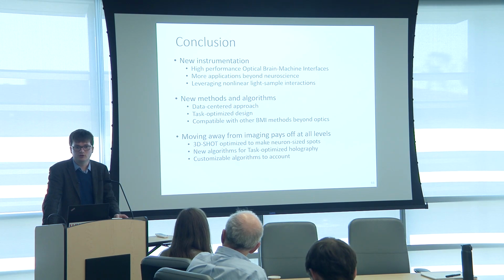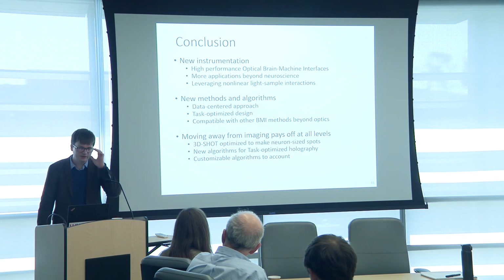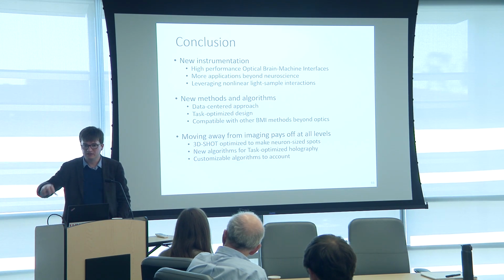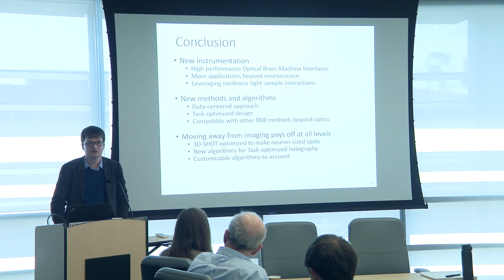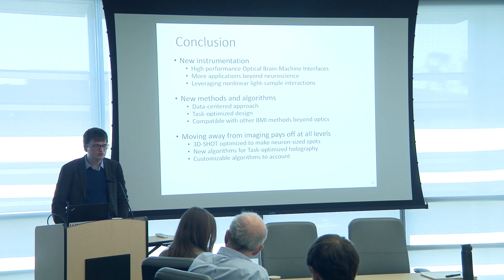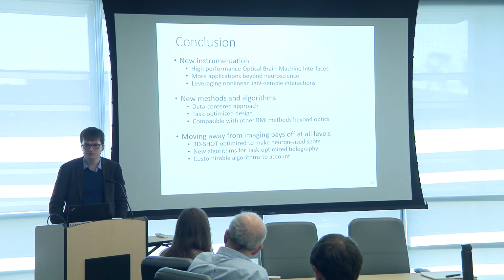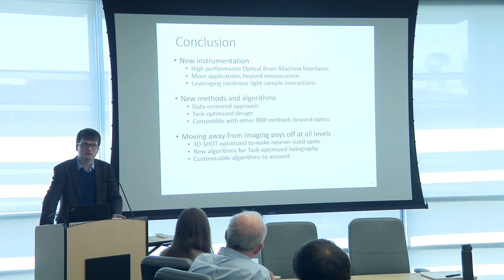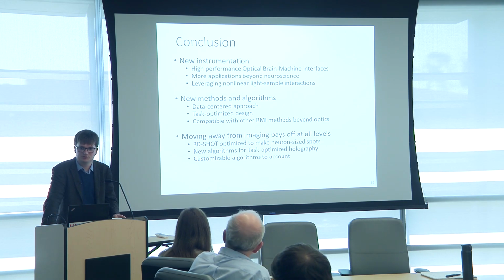Now, do we employ pulse dispersion compensation? Some of the lasers had a chirper built in, so we did use that, with the same approach of measuring the maximal fluorescence, or with an autocorrelator. But what we observed is we used lens doublets, and we didn't go through as much glass as you have to when you go through those super fancy microscope devices. So pulse compensation was not so much of an issue.